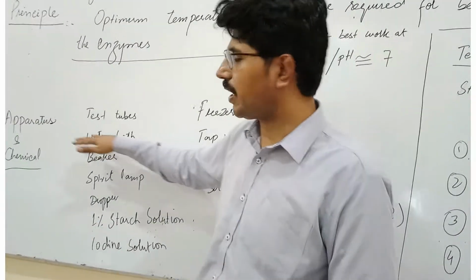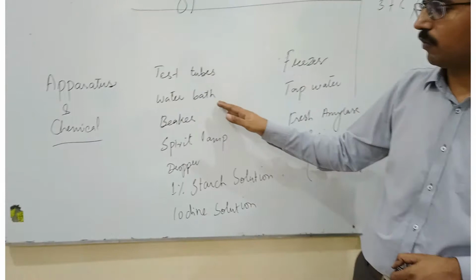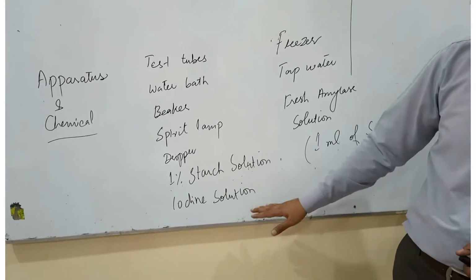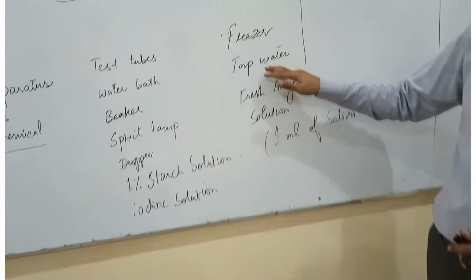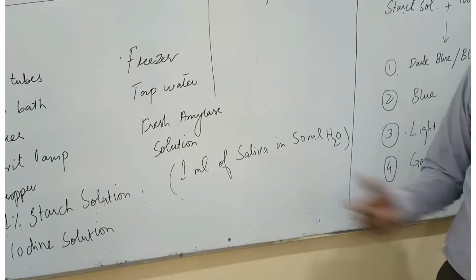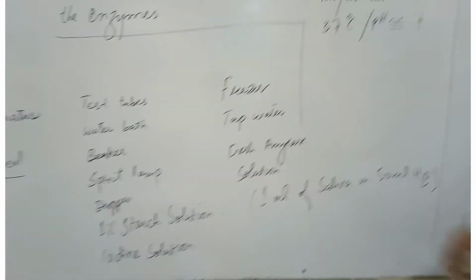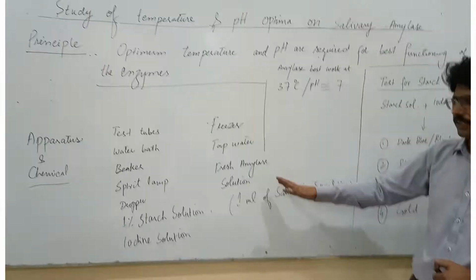The apparatus that we require for this practical are test tubes, water bath, beaker, lamp, dropper, starch solution, iodine solution, a freezer, tap water, and fresh amylase that we will form from 1 ml of saliva diluted in 50 ml of water. We are not going to use synthetic amylase because it can cause allergic reactions.